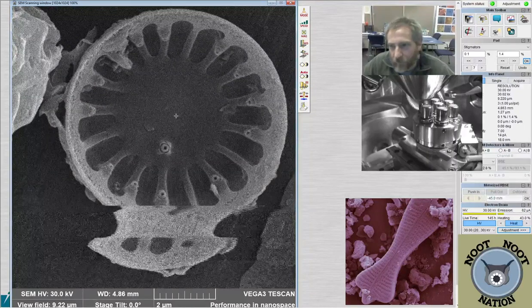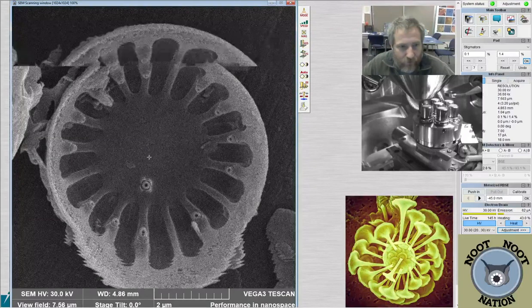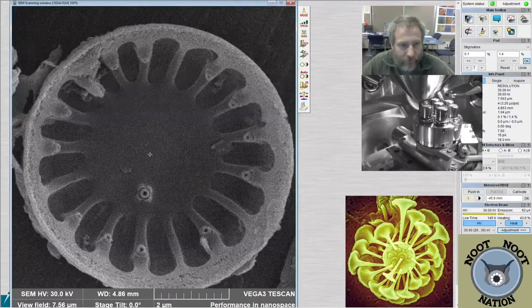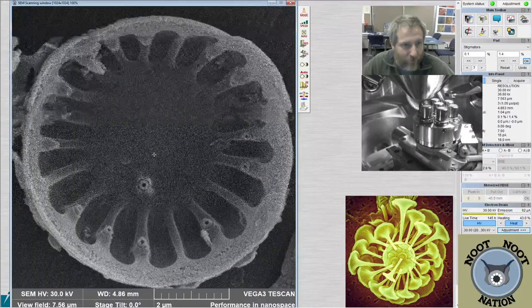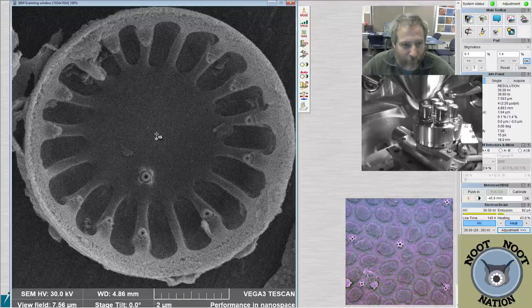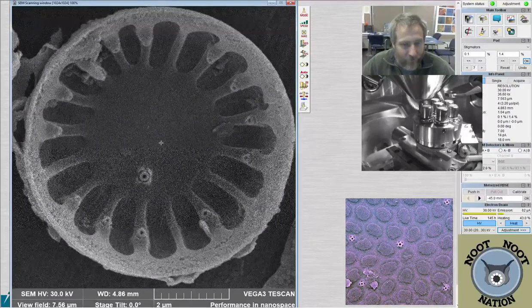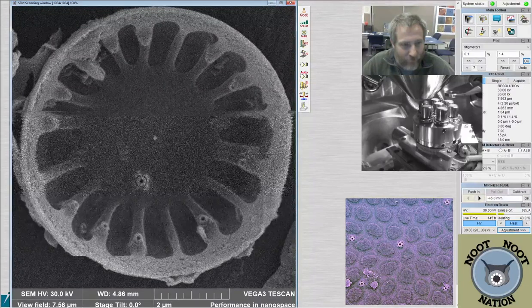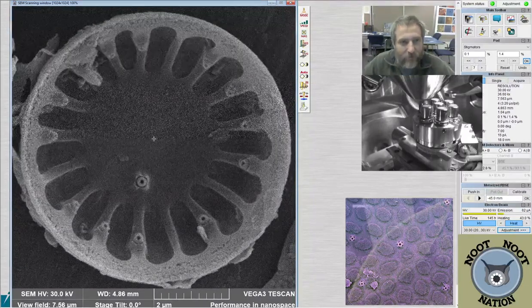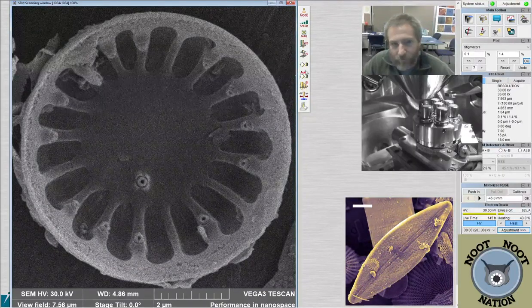So we're at around 30,000 times. I can zoom in a little bit. We're at like 36,000 times. It doesn't take a lot of zooming in when you're already super close to raise the magnification a lot. So just a tiny twist of that wheel where I used to magnify it basically moved us up 6,000 times. So once you start getting kind of close, that's the way it is.